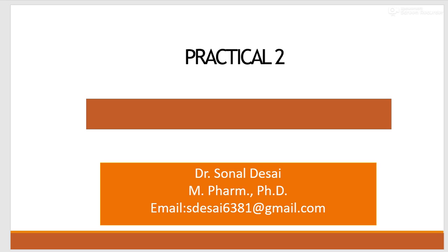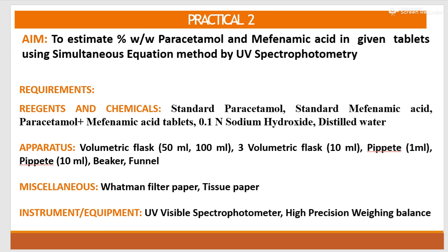Today, in practical number 2, we will discuss estimation of paracetamol and mefenamic acid in a given tablet sample using the simultaneous equation method. The aim is to estimate the percentage weight by weight of paracetamol and mefenamic acid in given tablets using the simultaneous equation method by UV spectrophotometry.